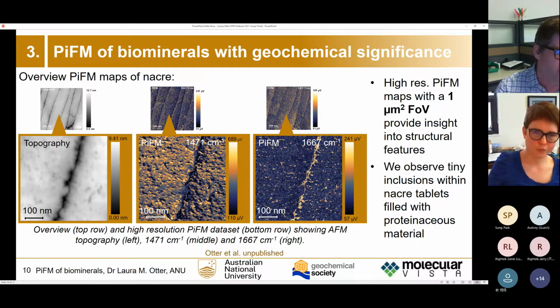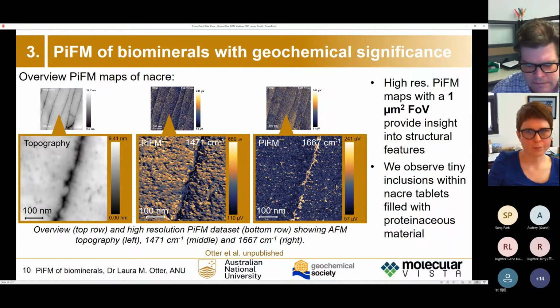Now, if you're going to be worried about material spreading across the sample as you're polishing it, then you may go to ion beam or something like this to clean it up. But we've noticed in the geosciences, a lot of just polished samples work quite well.